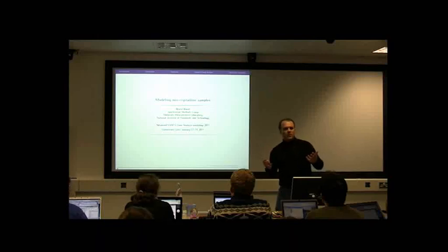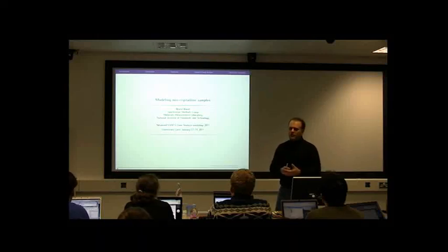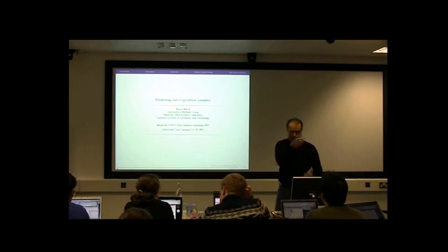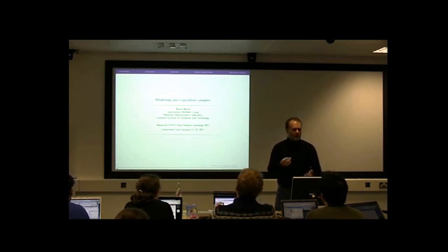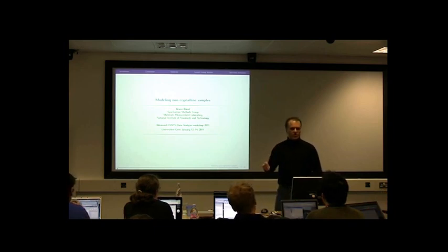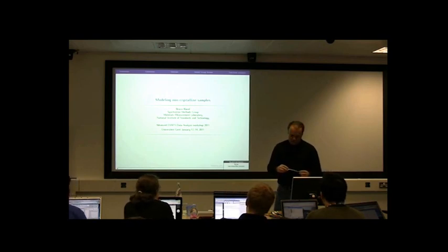Two parts of the problem, right? All of you who are coming to this for the first time have to do two difficult things right now. Difficult thing number one is you have to figure out how to run my crazy program. And thing number two is you have to figure out how to actually do your own research. And those are both hard. Well, hopefully the second one is the harder problem than the first one. But they're both kind of hard problems. And I like to separate them out somewhat.